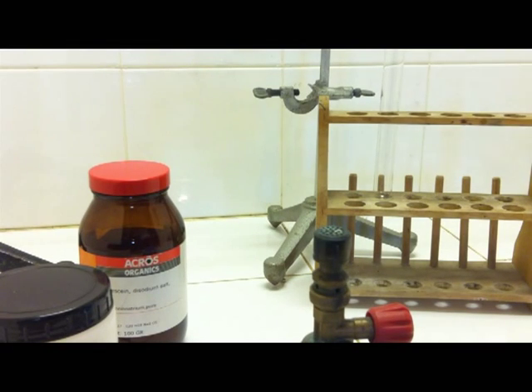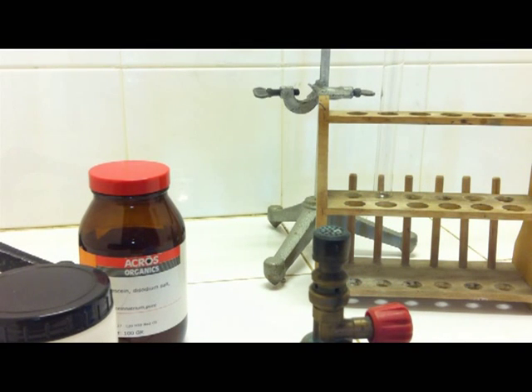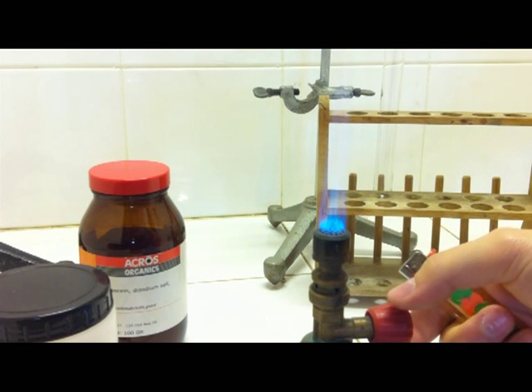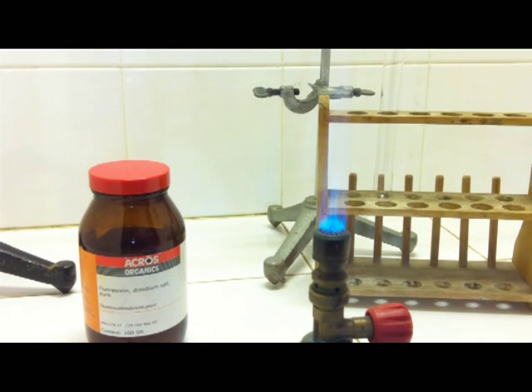Hello and welcome to another chemistry video. Today I would like to show you an experiment to see the effects of phosphorescence. You all may know this from emergency signs declaring the emergency exits of public buildings. Usually, these phosphorescent materials are based on zinc sulphide doped with rare earth metal oxides.